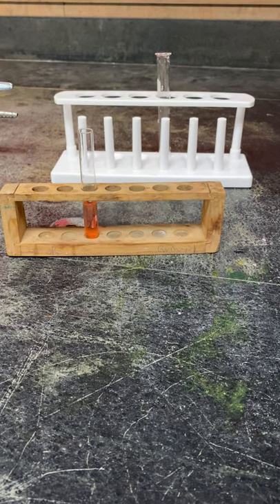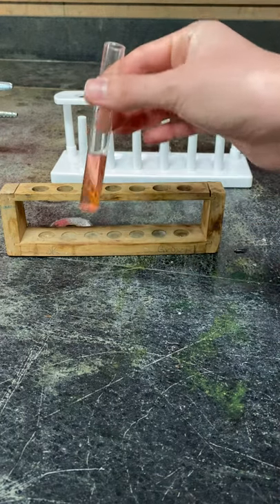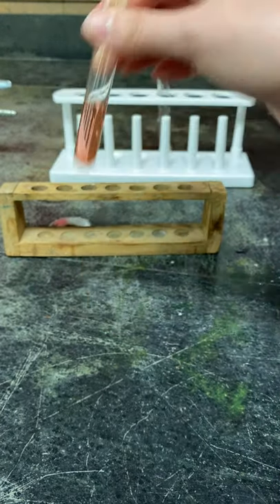All right, so these are our test tube racks. There are different test tube racks that we also have besides these two, but in general you want to know that test tube racks can hold test tubes upright since they do have a round bottom.